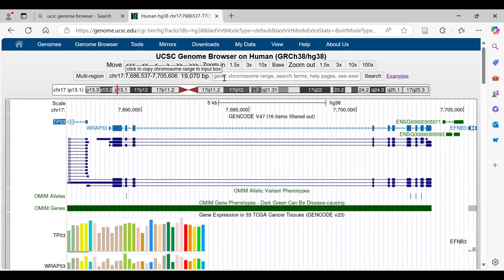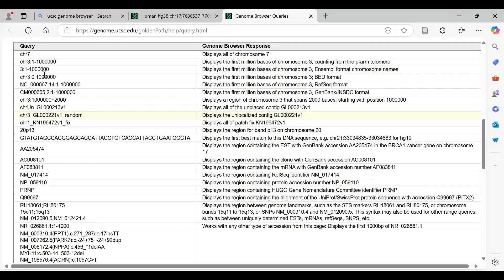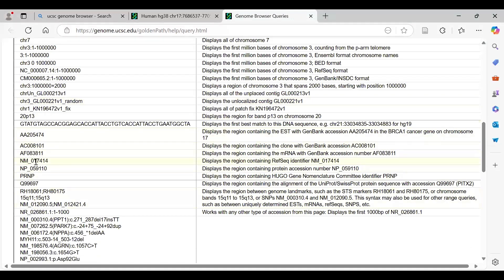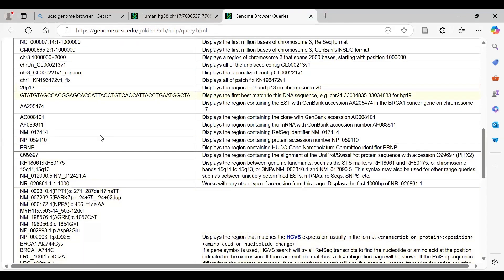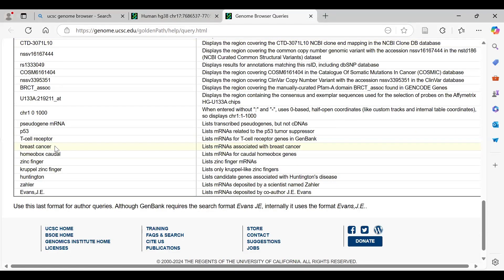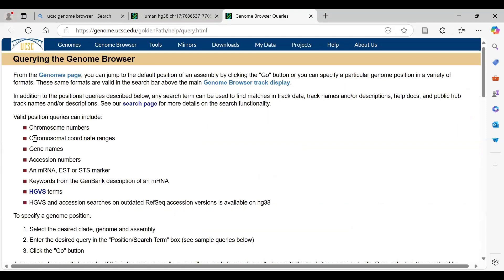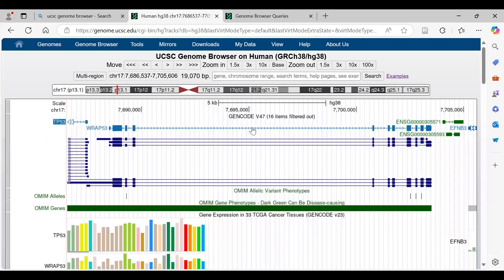Along with this, we have the search query box where we can give multiple types of inputs: gene name, chromosome range, search terms, and many more. The different types of input queries we can give to the genome browser include chromosome name, genomic locations, various IDs such as NM accession numbers, sequences, and gene names or partial letter strings.